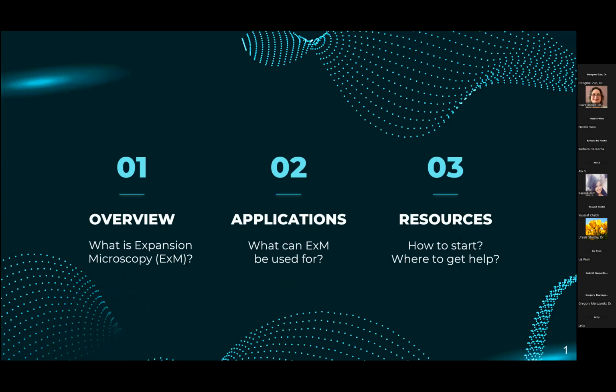So like I said, I'm going to be first giving you an overview about what expansion microscopy is, and then we're going to talk a bit about applications, what people commonly use it for, or what different variants there are. And then lastly, the resources that are currently out there for different people of different levels of expansion.